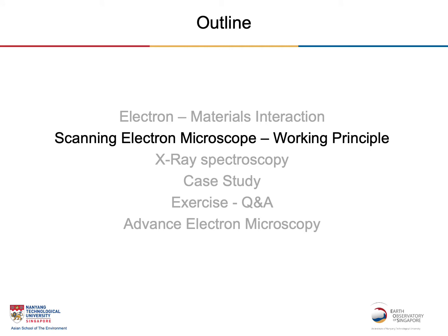Okay, now let's take a look at what this electron microscope is. To be exact, it will be the scanning electron microscope. How the creature looks like, and how does it work, and what we can use it for.